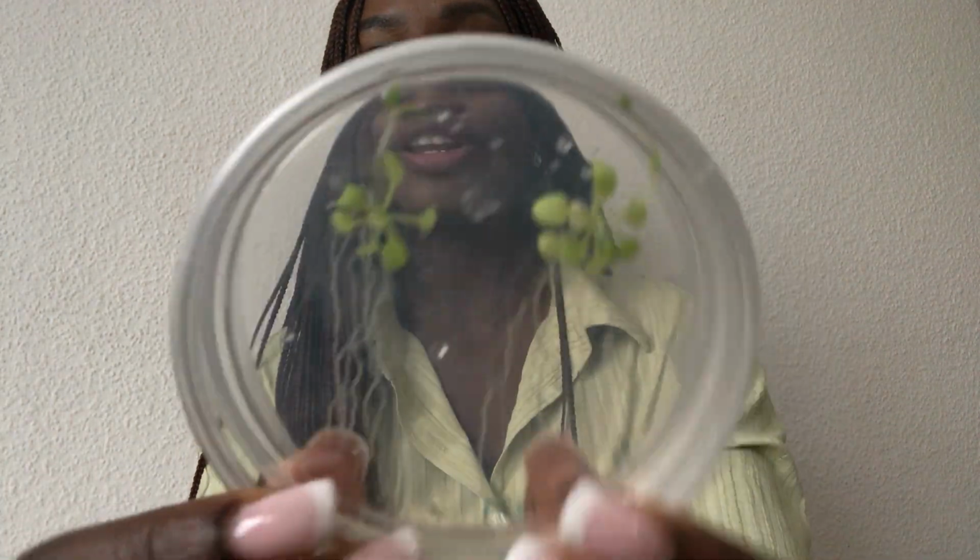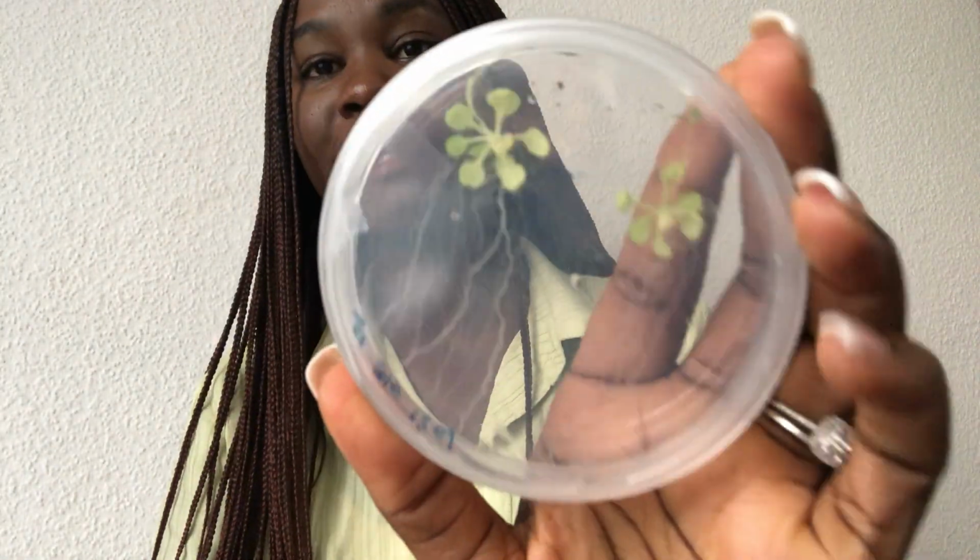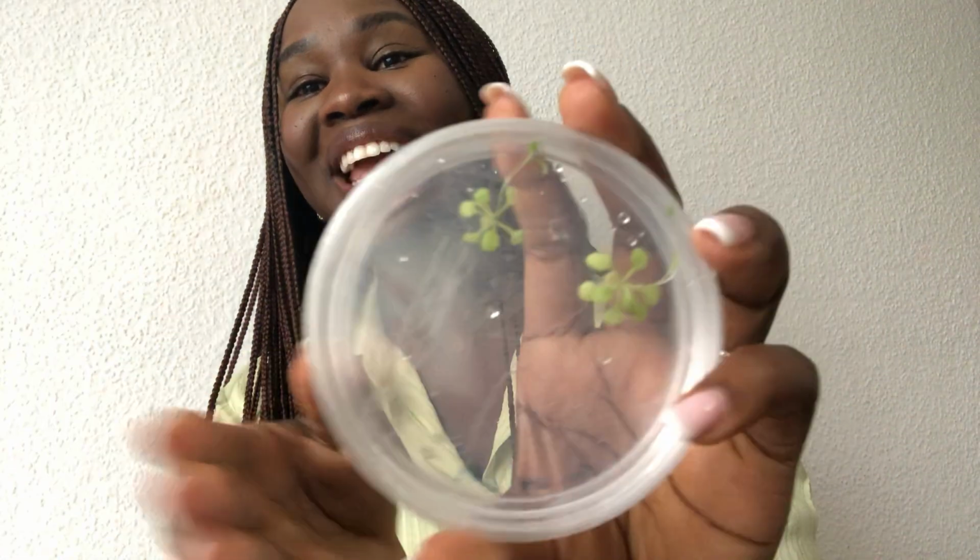And you can also see that once the plants have grown, you don't see any form of infection, and yet these growth media are quite rich. So it means if there was presence of any external bacterial cell or fungal cell, they would easily proliferate in here because these media are nutrient rich, right?